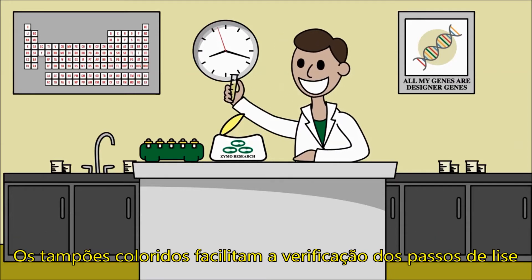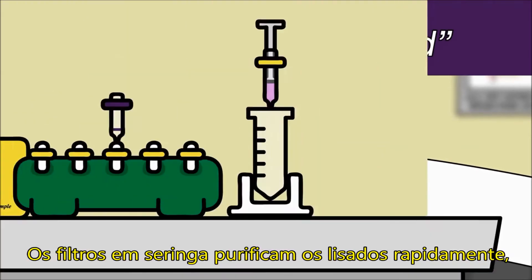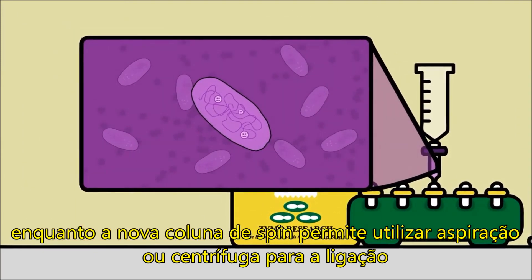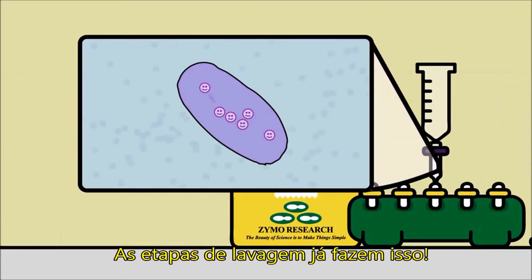The colored buffers make it easy to see that you've lysed and neutralized bacteria. The syringe filters clear lysate fast, while the new spin column gives you the chance to use a vacuum or centrifuge for binding. And you won't need alcohol to purify the DNA of endotoxins, salt, and protein — the wash regimen's got that covered.